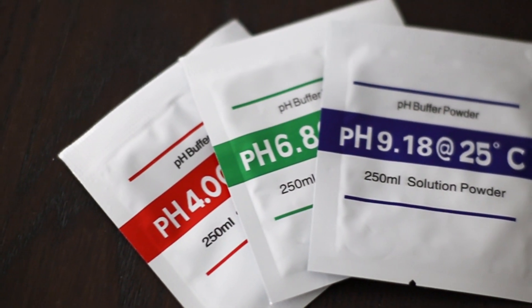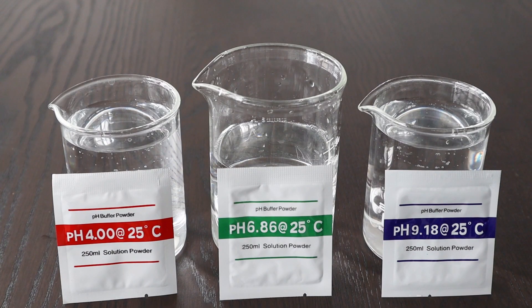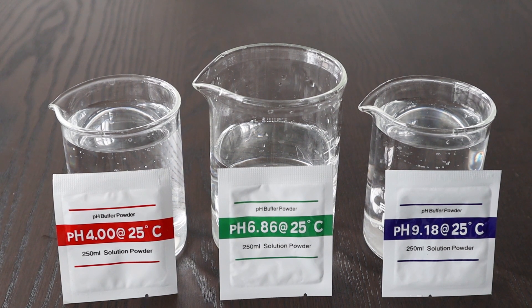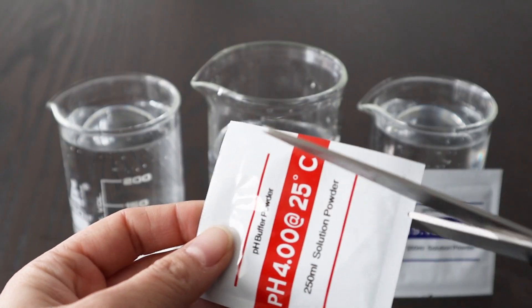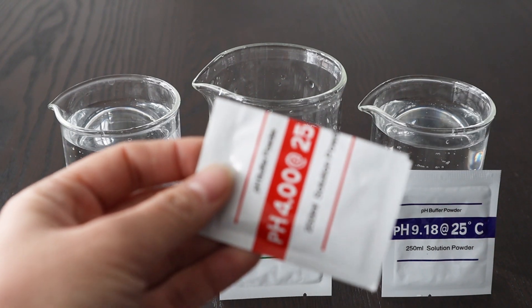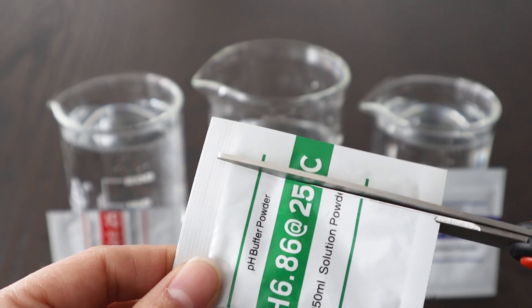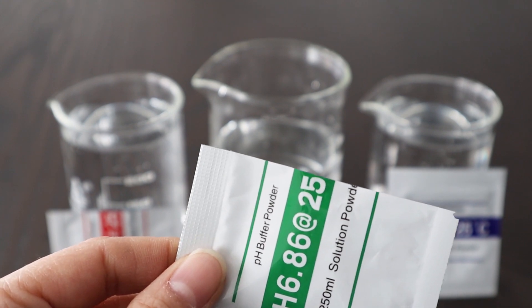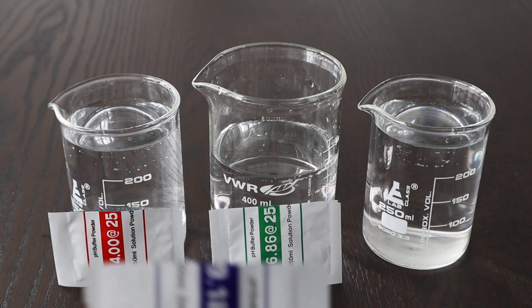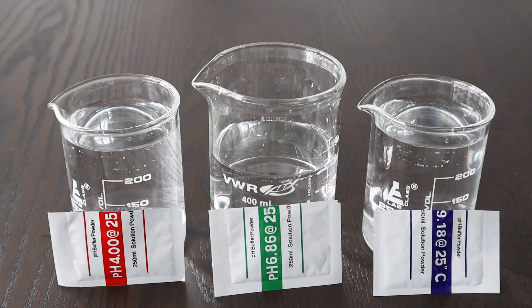To calibrate this specific meter, it needs three calibration powders: one in a 4.0 solution, one in a 6.86 solution, and one in a 9.18 solution. During this calibration process, you can use two of the powders — the 4 and the 6.86 — to get a decent amount of accuracy. If you want accuracy to 0.01, that's where the 9.18 solution comes into play. The more solutions you calibrate with, the more accurate the meter should be.